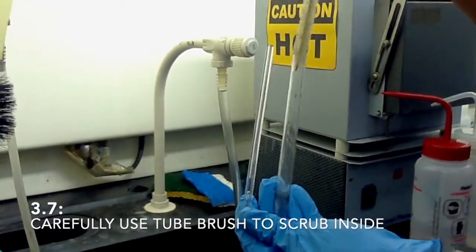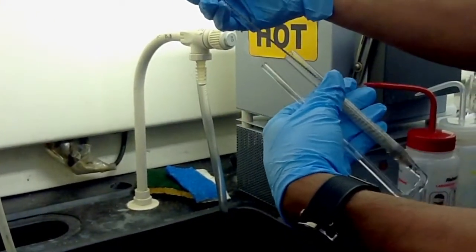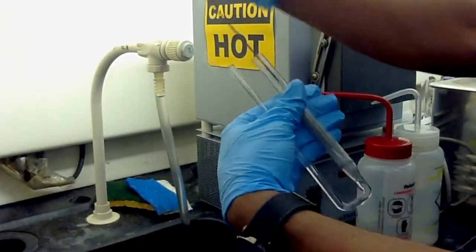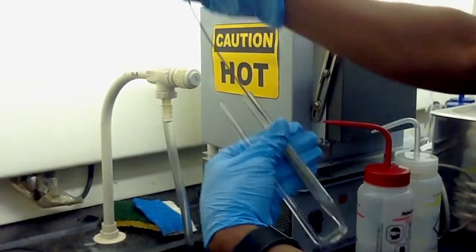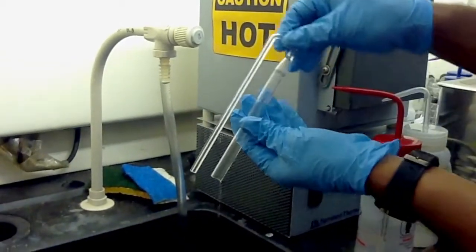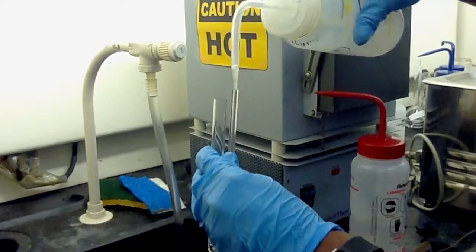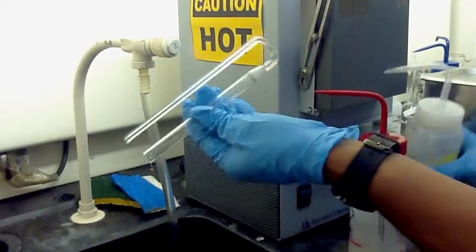Use the brush, but this time be careful that you hold the tube really gently, not tightly, or it can break. Do a little bit of brushing and then clean it out. Once again you can put some acetone or isopropanol here and wash it out.